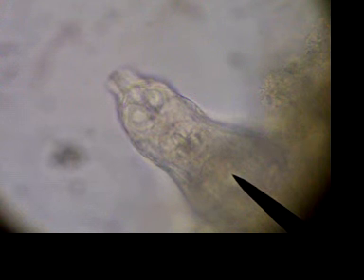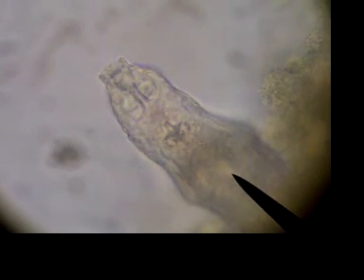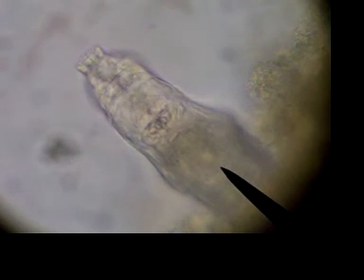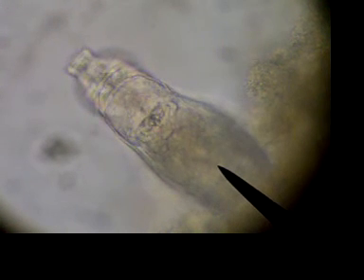Okay, take a look. It's really got to spin around in purple. It's a little short line. It's kind of black-looking. So it looks like red. Exactly. It's open for all of us.